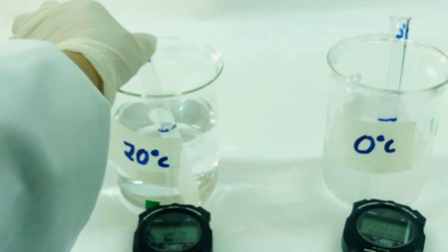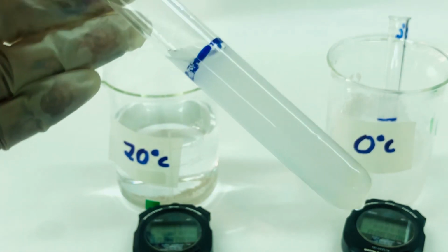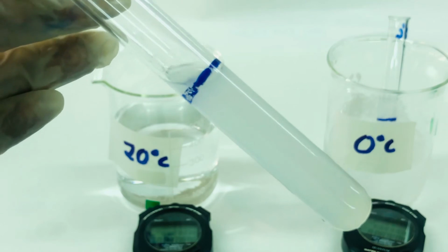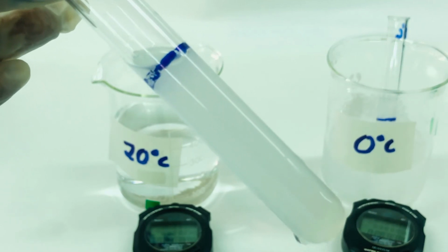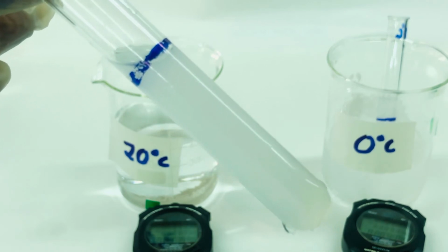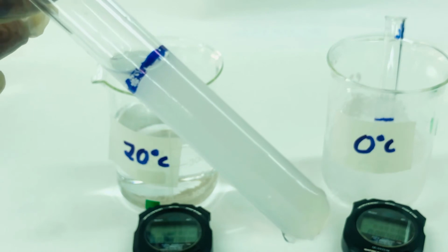Similarly, in the 20 degree C sample also, you cannot see any reaction that has taken place. Maybe it will take more time for this sample to curdle and casein to settle down.